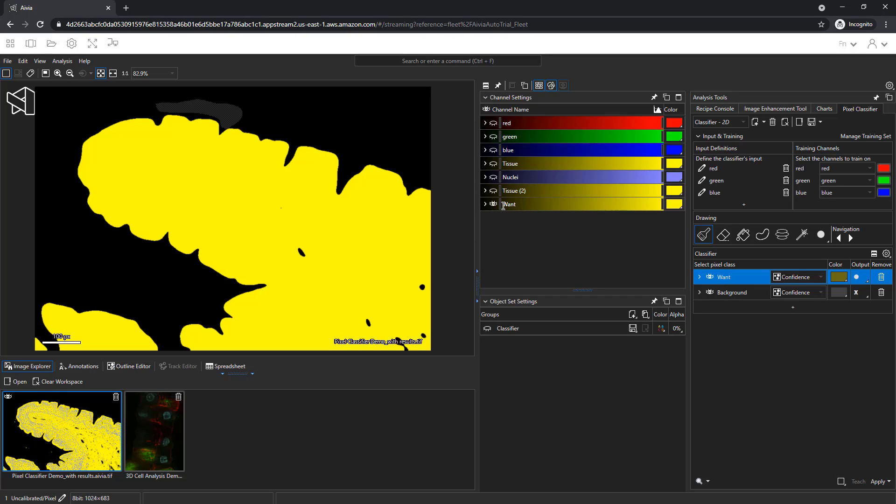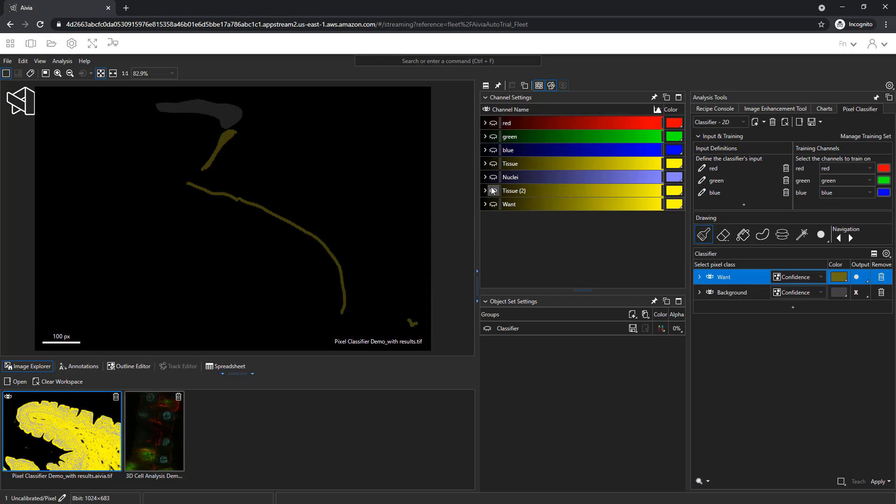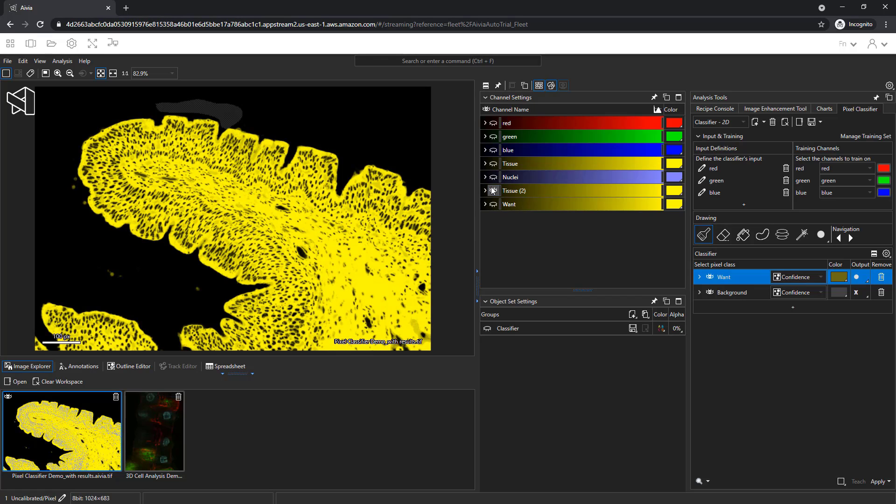This new channel allows me to perform additional analysis. With additional training, I could improve the pixel classifier and create separate classes for the tissue and nuclei.